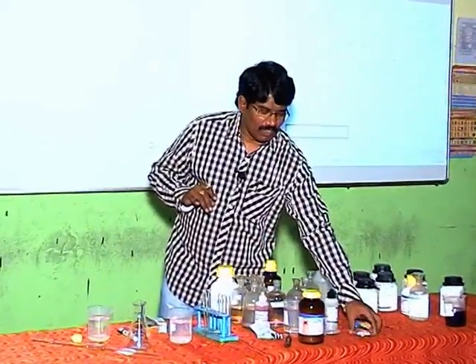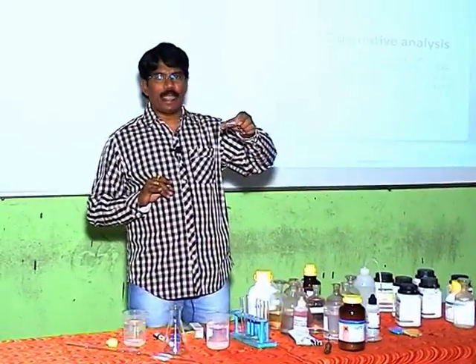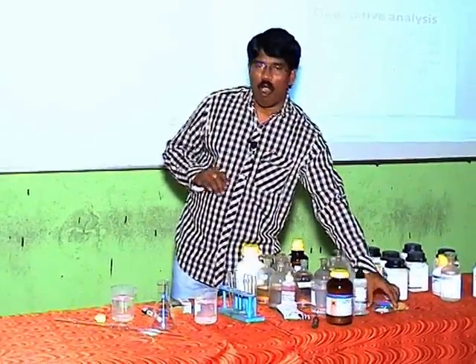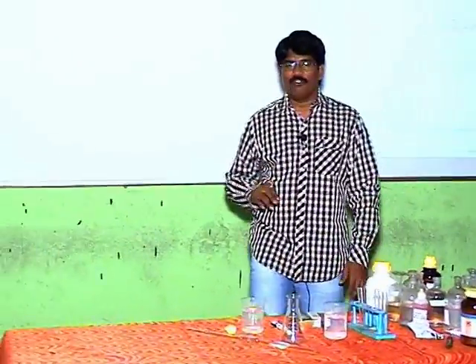Then manganese salts are pale pink colored. And apart from these 3, all the remaining are white colored salts. So if any one of these salts comes, then you need to mention that color against the color property in the physical examination. Suppose no color, you can write just no color.